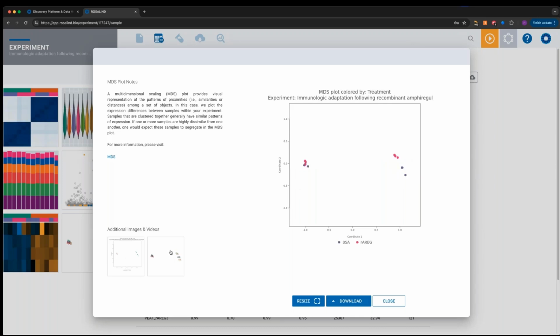So that's an interesting question and suggestion to integrate this into our interactive analysis. I'll have to think about that some more. So I guess the short answer is it's not currently available on interactive analysis. It's in the QC, but that's a really intriguing idea to incorporate this on interactive analysis. So I appreciate that question, and we'll certainly think about this offline.